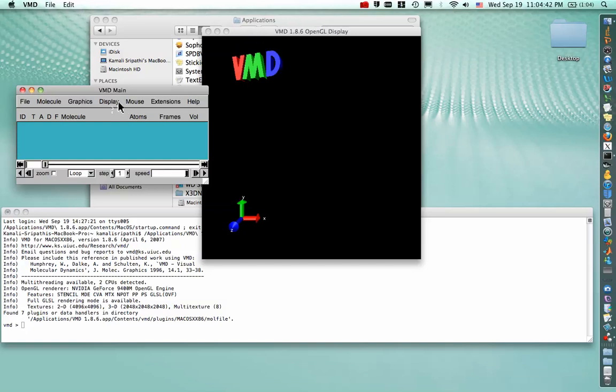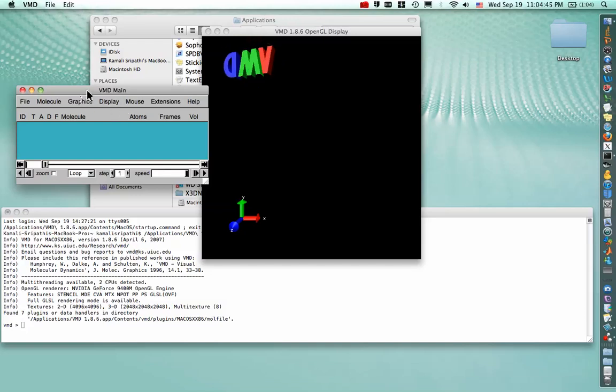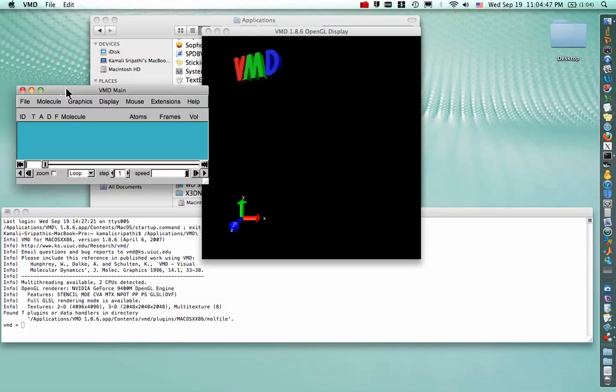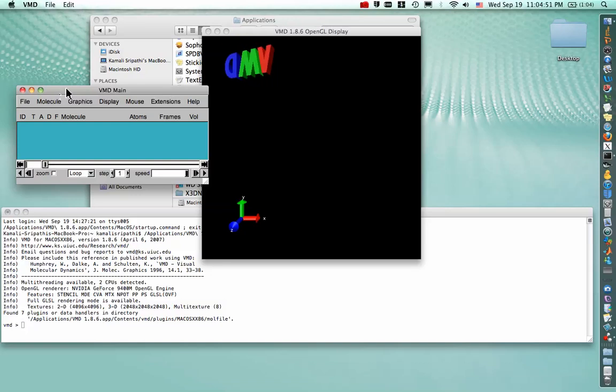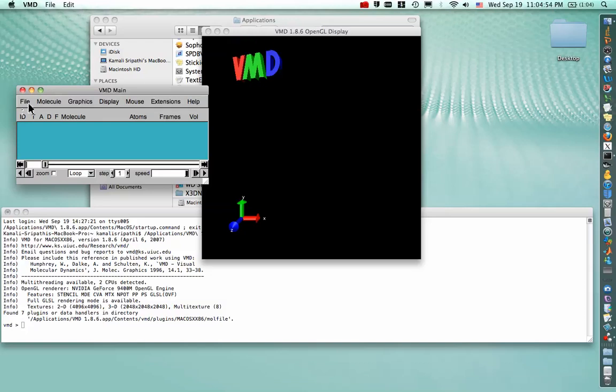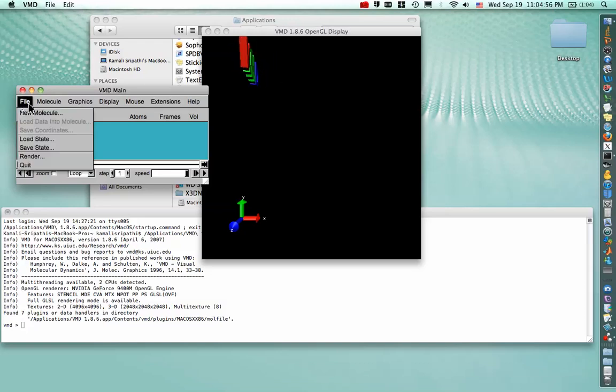Unlike PyMOL, though, VMD doesn't have a direct connection to the PDB, so we'll have to just download our structure or upload our structure into VMD. And we can do that because our structure is already saved on the desktop.